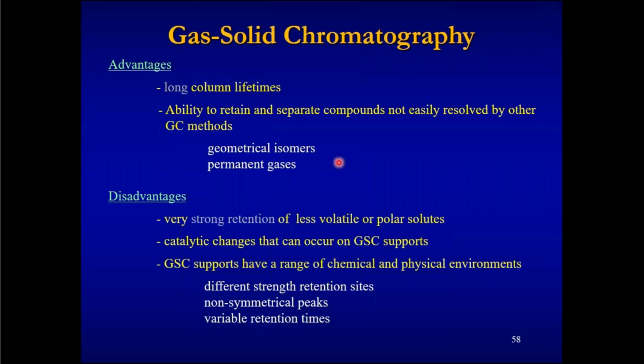But the same two isomers may have very similar solubility in a liquid, and therefore it's not easy to separate them by gas liquid chromatography. It is possible to separate them by gas solid chromatography, but not by gas liquid chromatography. So that's a major advantage of gas solid chromatography.